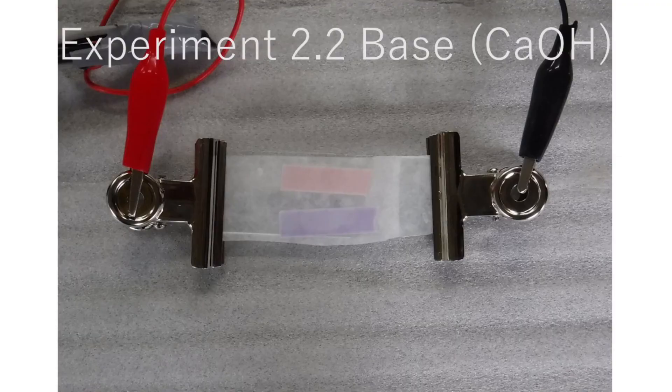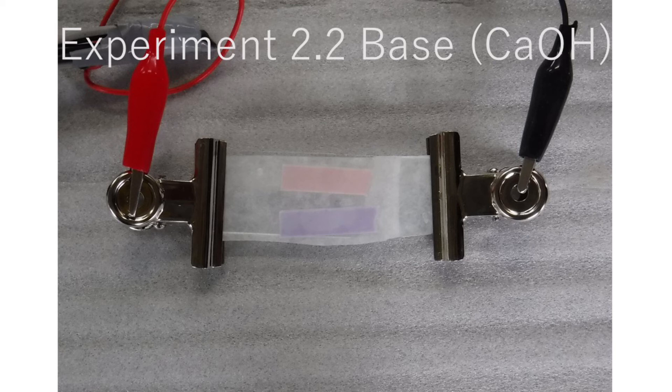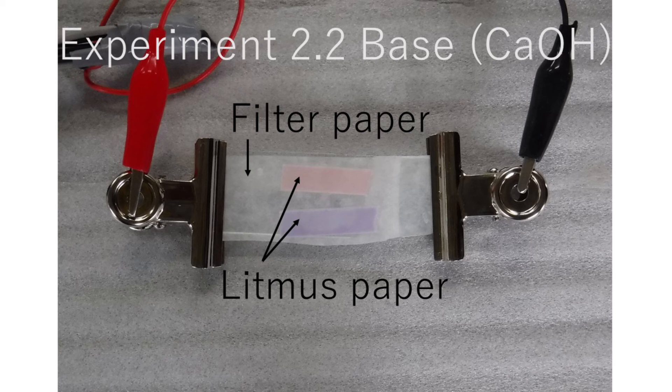Let's try another experiment to avoid the reaction at the negative electrode. Filter paper is placed first, and then two litmus papers are placed on it.